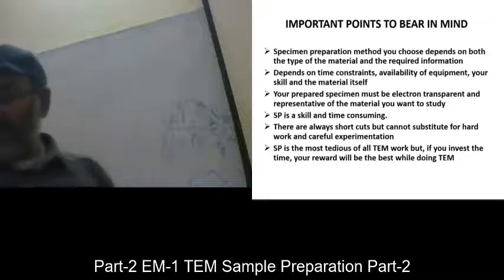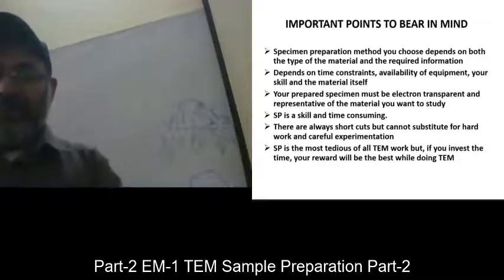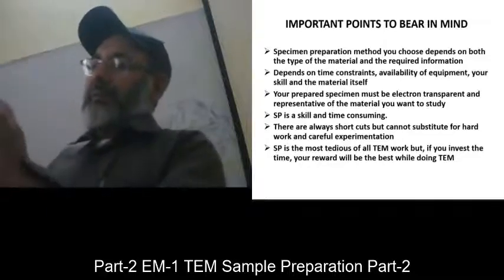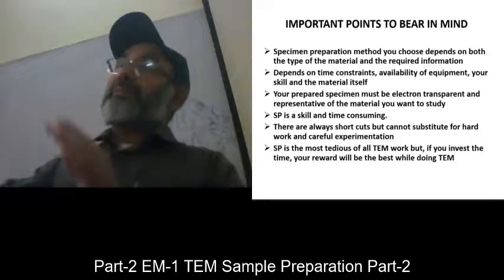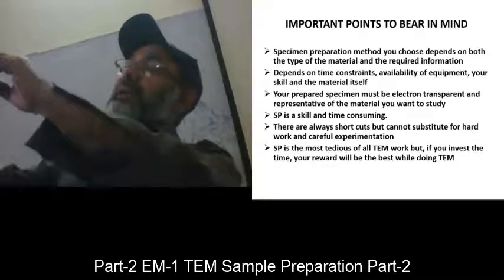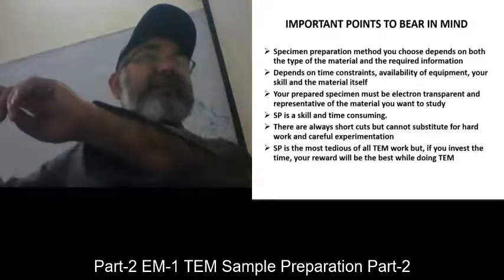If you combine these things, for example, I combine these things here and I grind this sample, right? These are three grains joining together. So this middle is a void, it is a free space there.